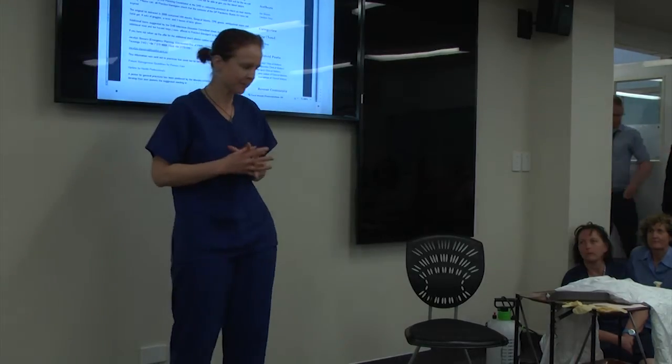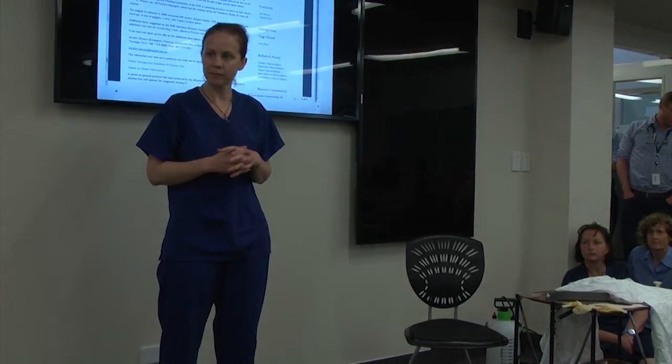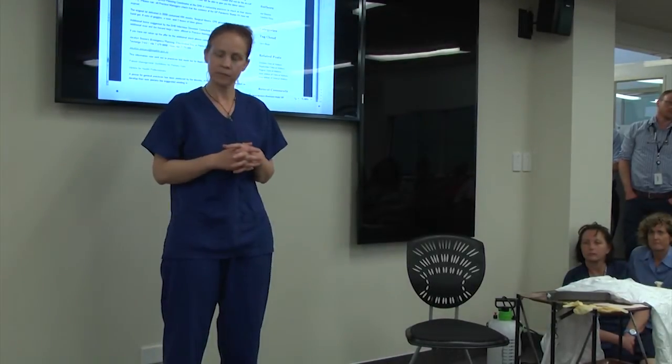My lovely assistant here, Kate, and I are going to demonstrate how to properly put on and take off PPE using the buddy system. I will be Kate's trained observer. Kate will put on and take off her gear. As we do this, we have a check-off list similar to a flight warm-up for an airplane. We're not going to skip any steps — we're going to take our time and do it step by step. Our first step is to make sure we have all of our equipment.